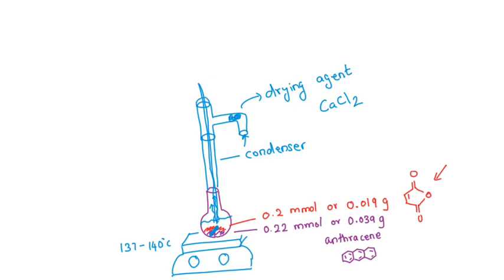That's it. That's the heating setup. It probably takes 30 minutes of heating. After that, we will separate the product from the solvent and the unreacted product through a filtration setup.